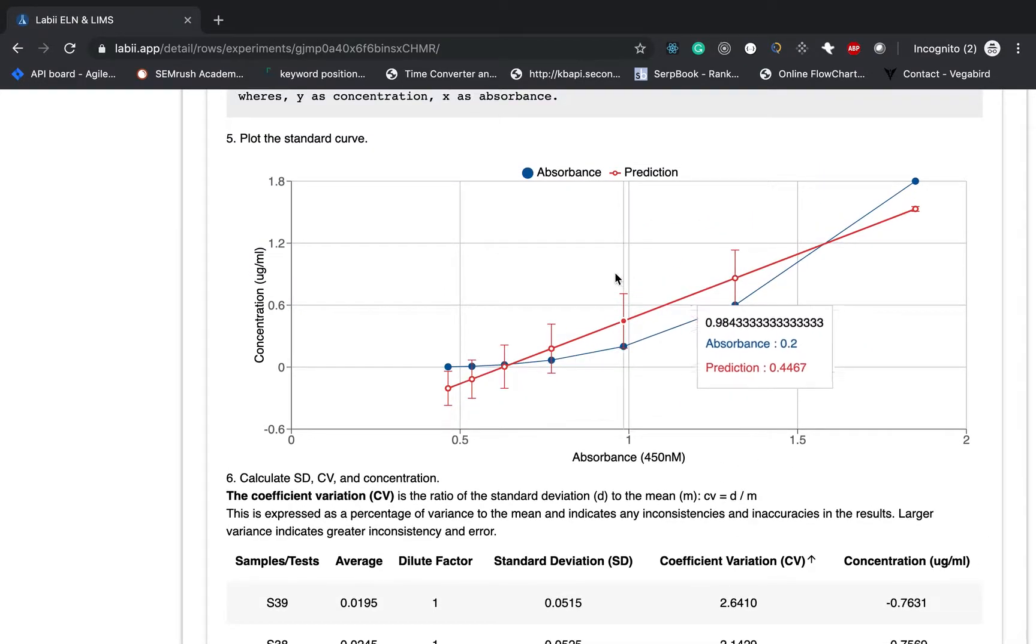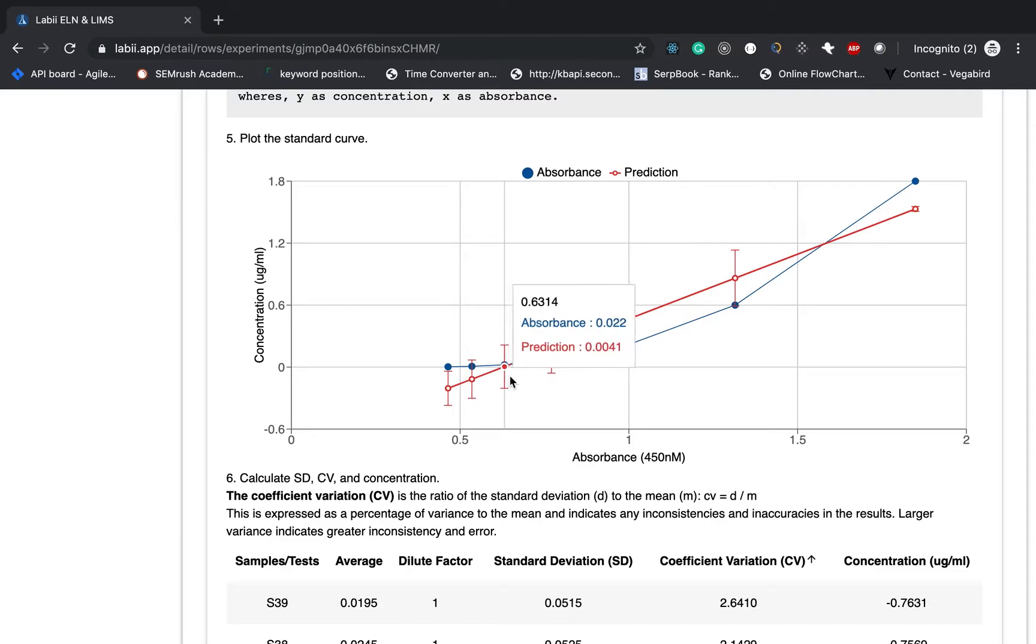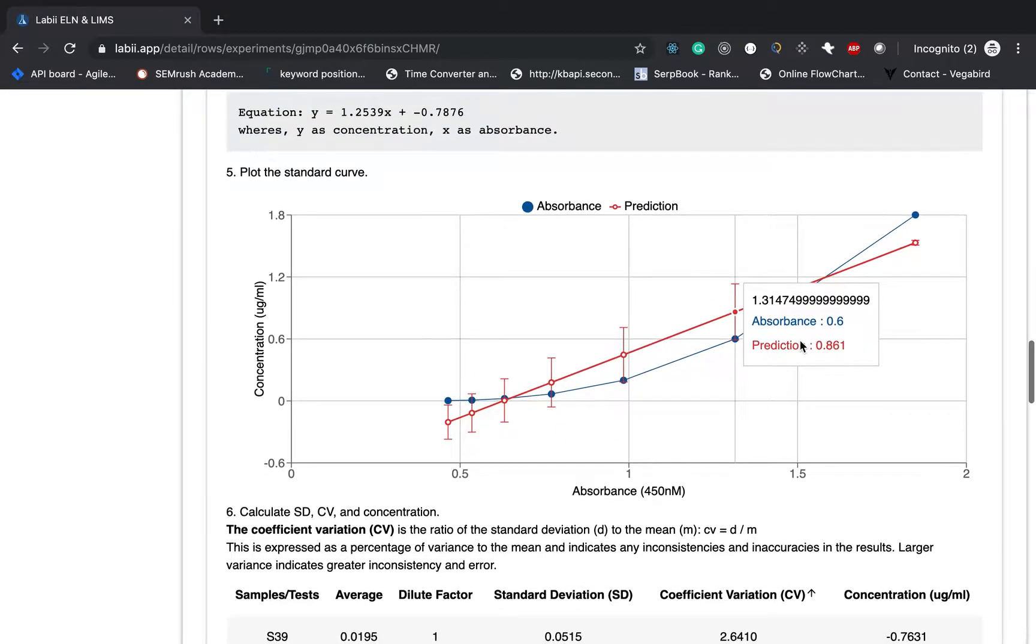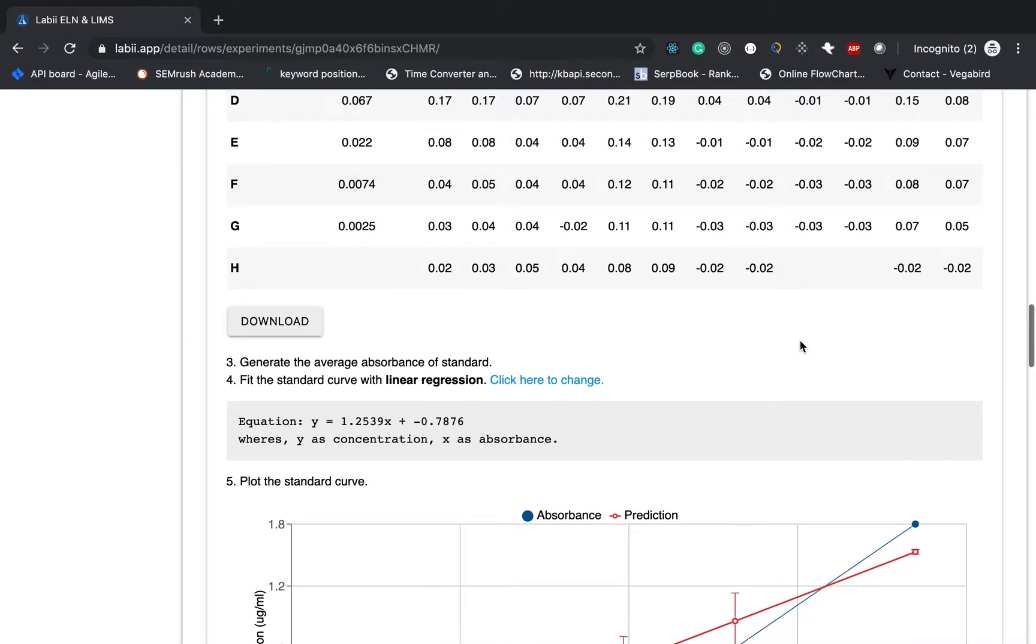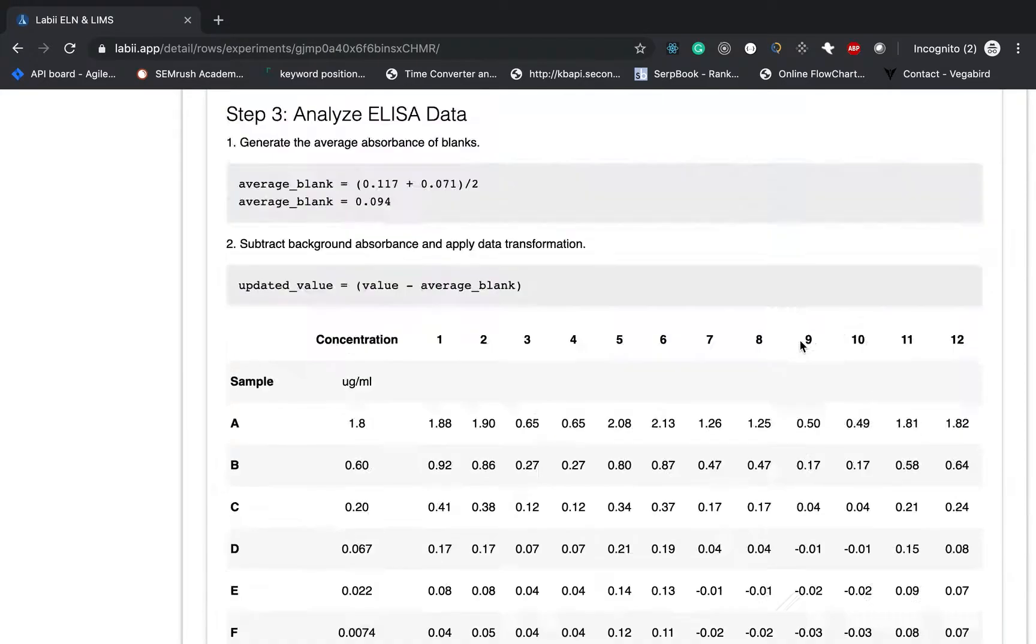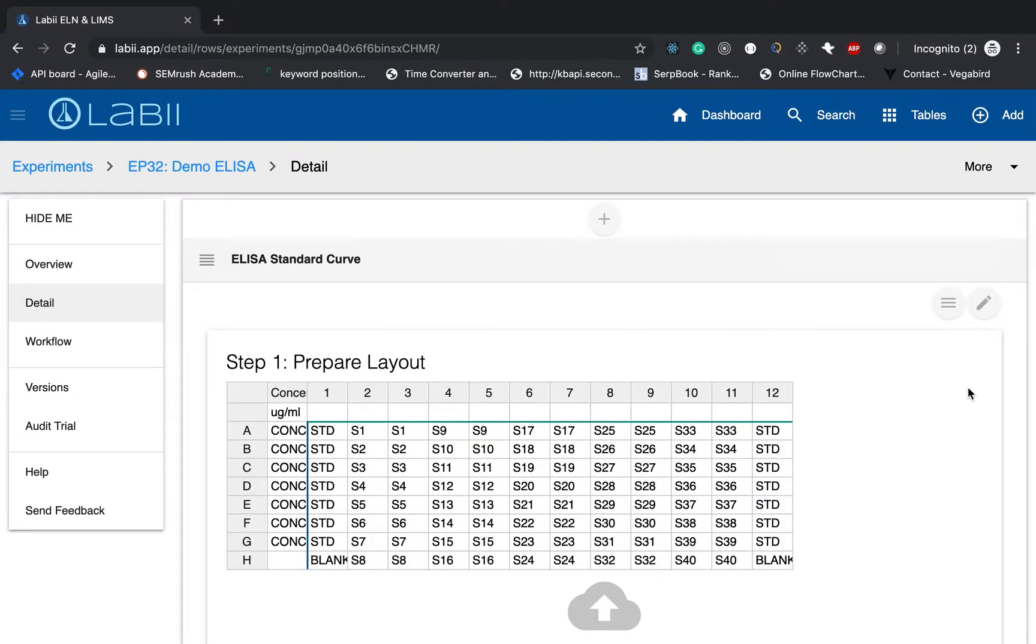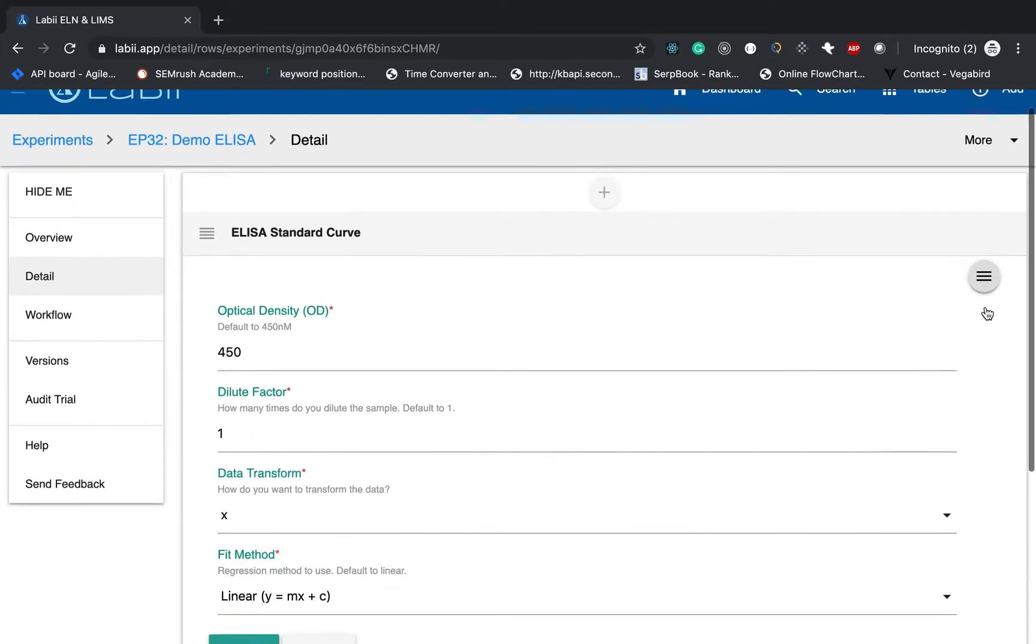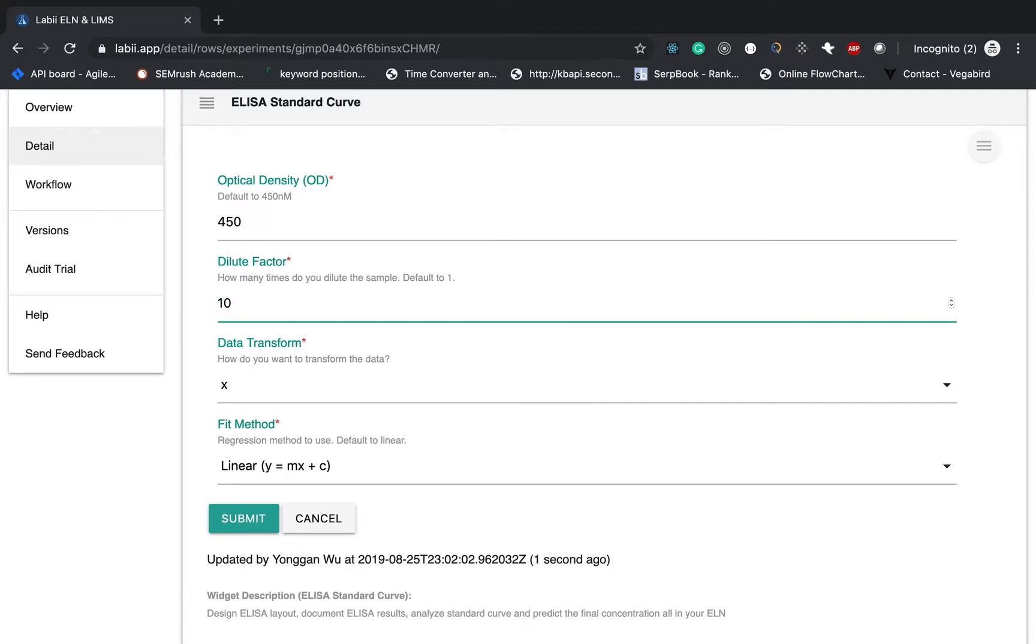And actually you can change the regression method. You can do so by clicking this edited icon on the top. And you will notice there are many other things you can change as well. For example, if you dilute your samples, you can change the dilute factor. And I will put the 10 as an example.